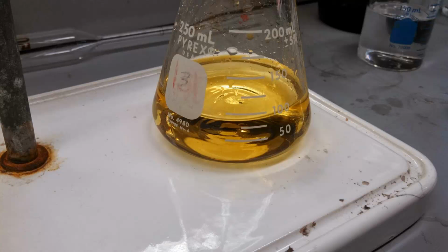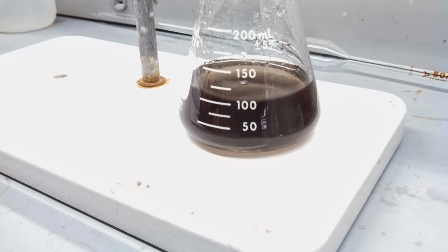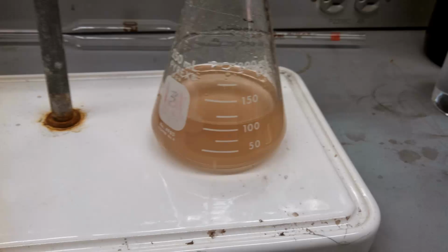Word of warning, if you go too far and get the yellow too faint, there's not going to be enough triiodide to complex with the starch, and you won't get this magnifying glass effect on the endpoint. You just won't see anything. This is what it should look like when you add the starch. From here it should be less than half a milliliter of titration until you get to the endpoint, which is where this blue color goes away.